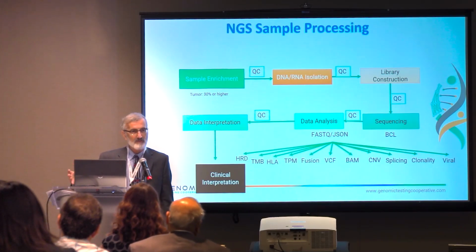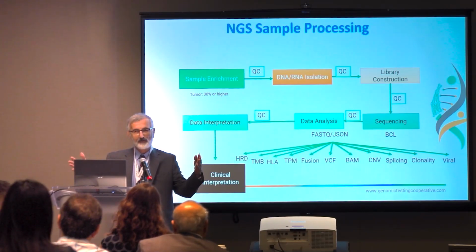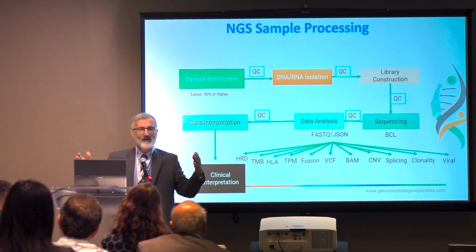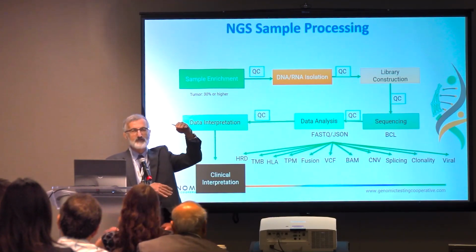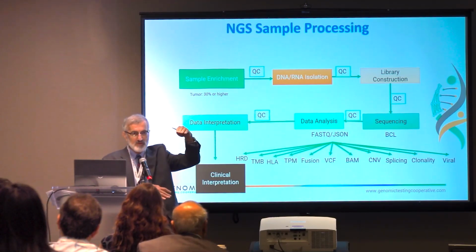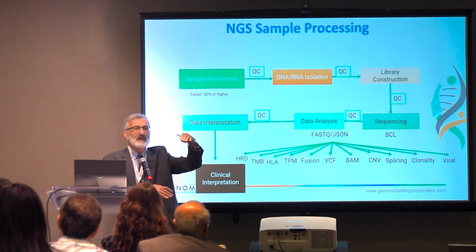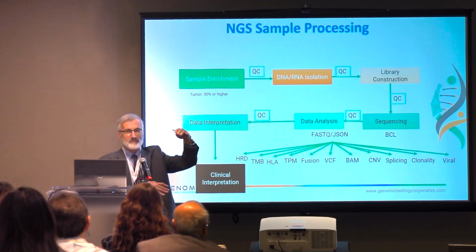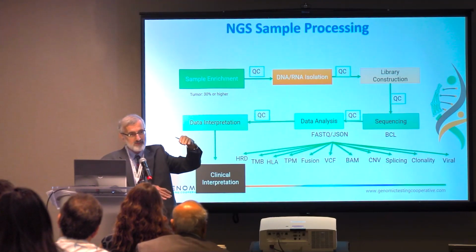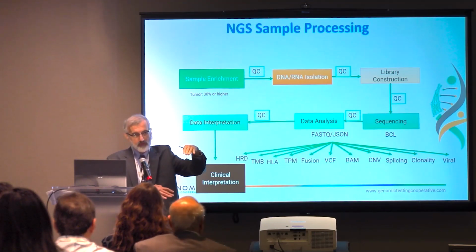The other thing, we developed another software in which we look at the mutation in the same run. So if we see a specific mutation in the same run in a large number of cases, in 4 or 5 cases out of 100, we ask the question, is this artifact, is something going on there? So all these are very important things.